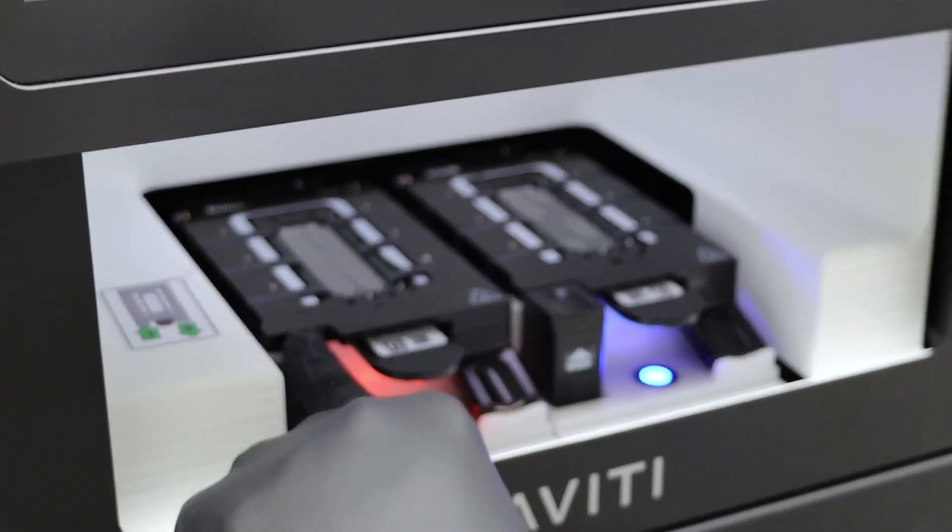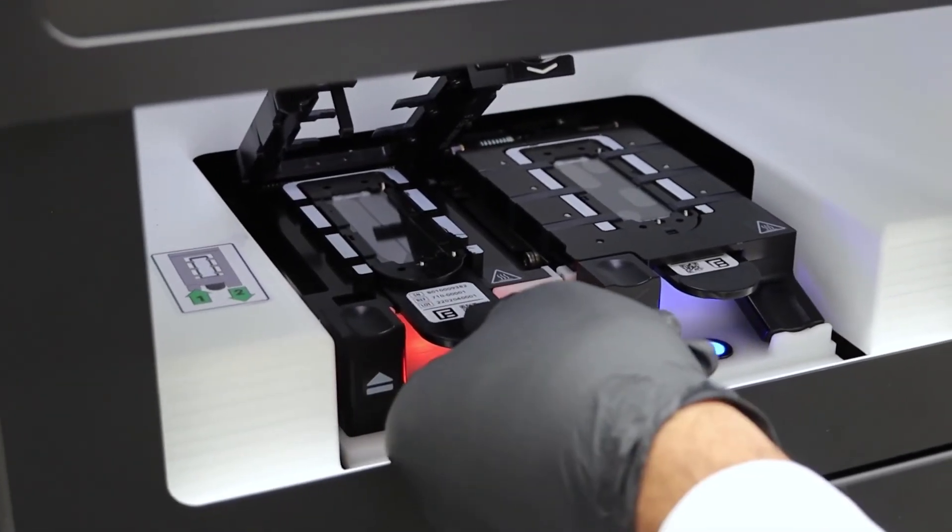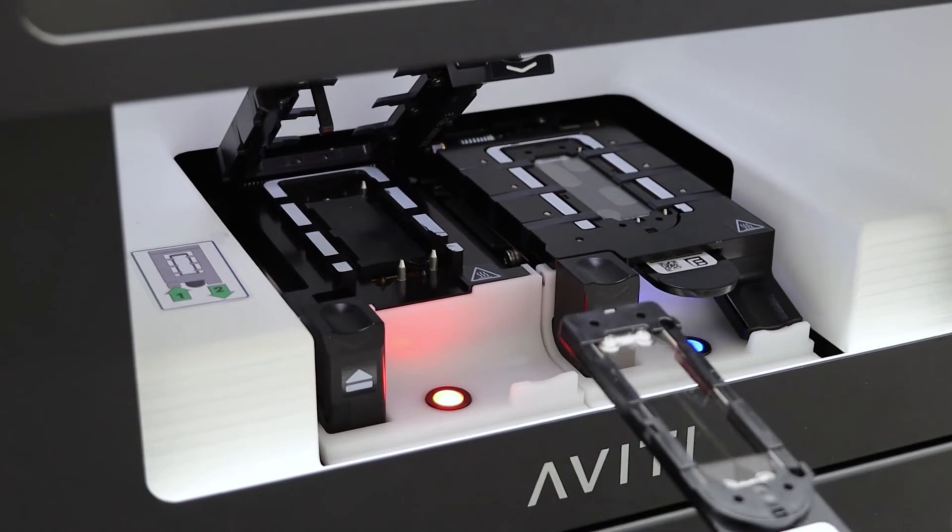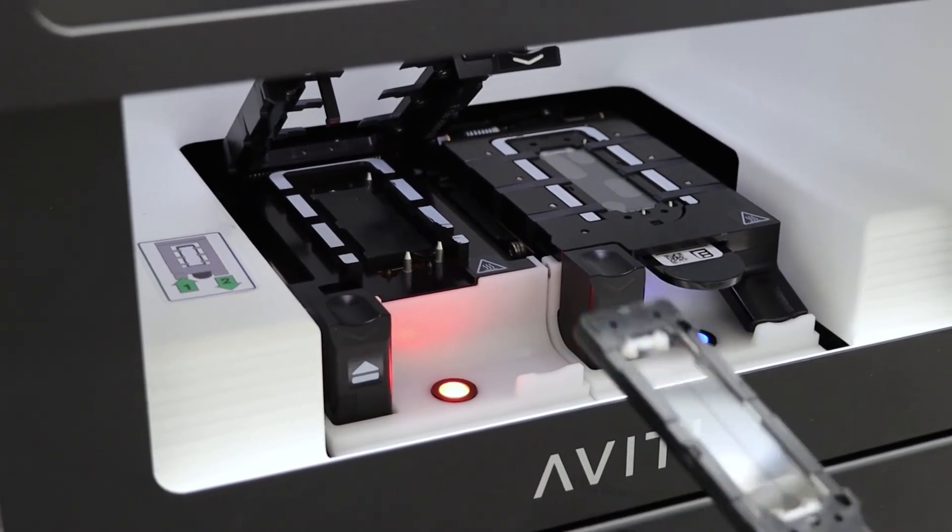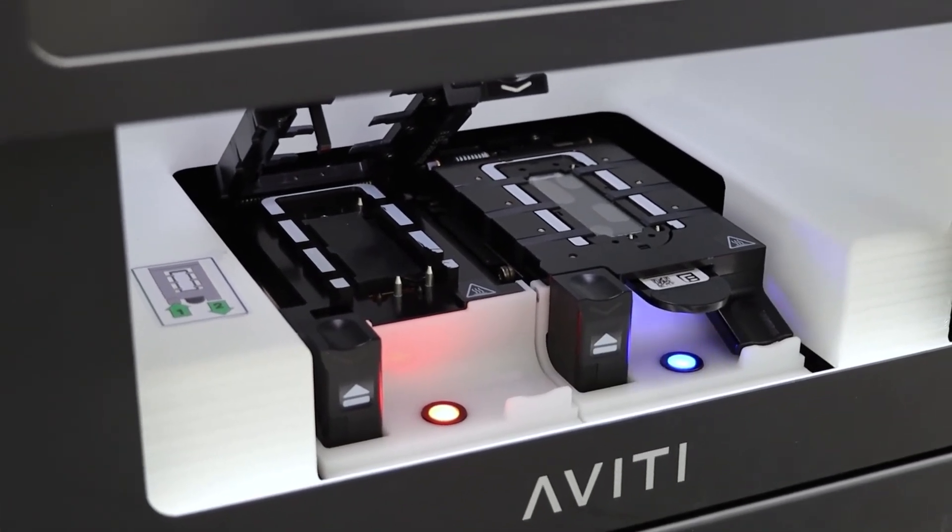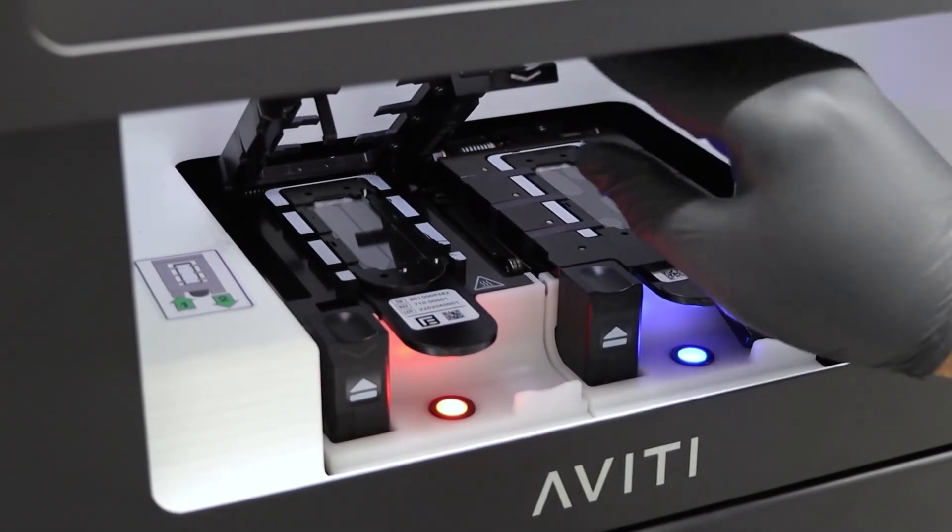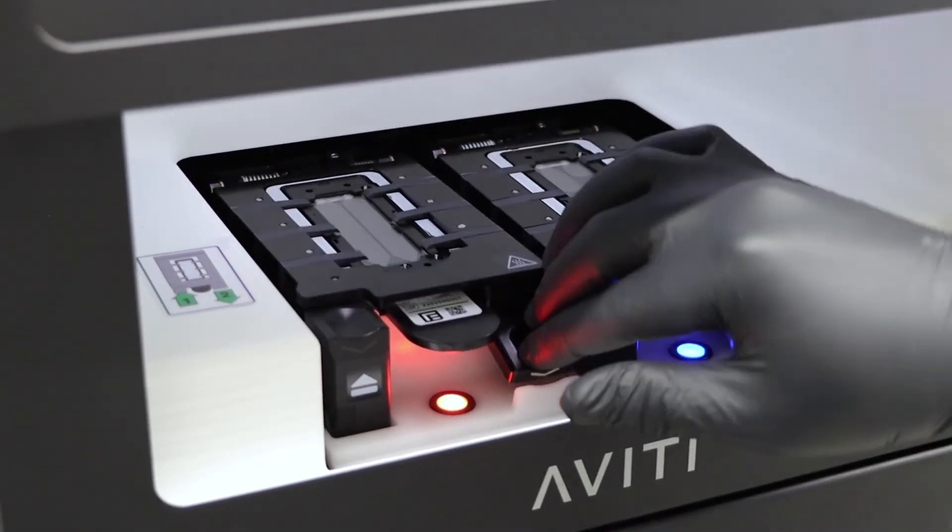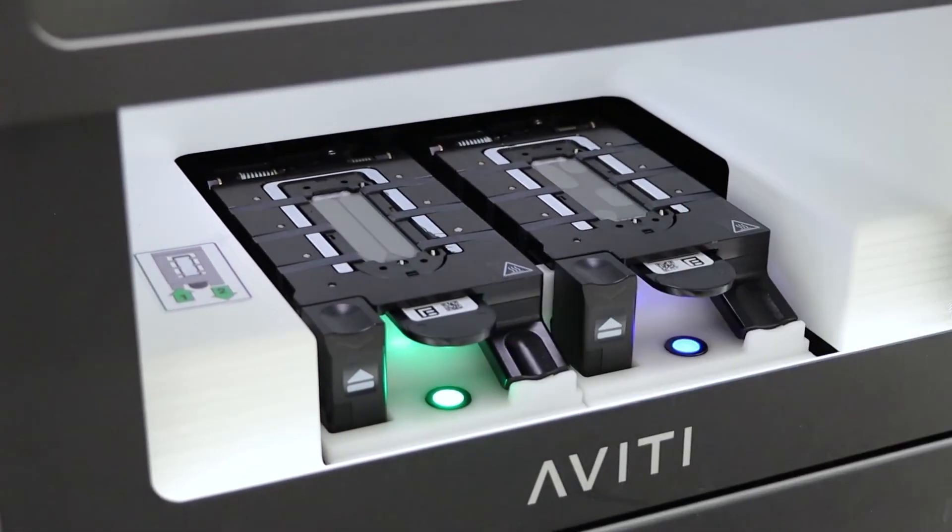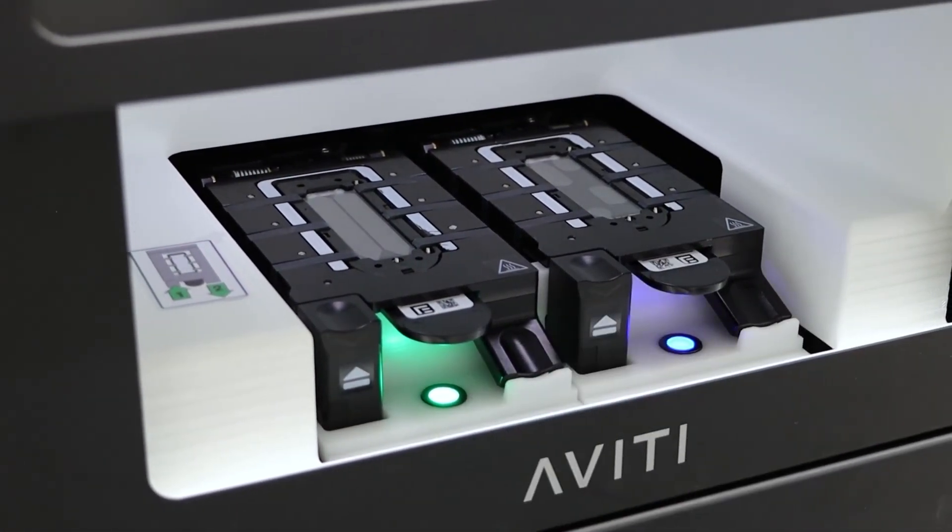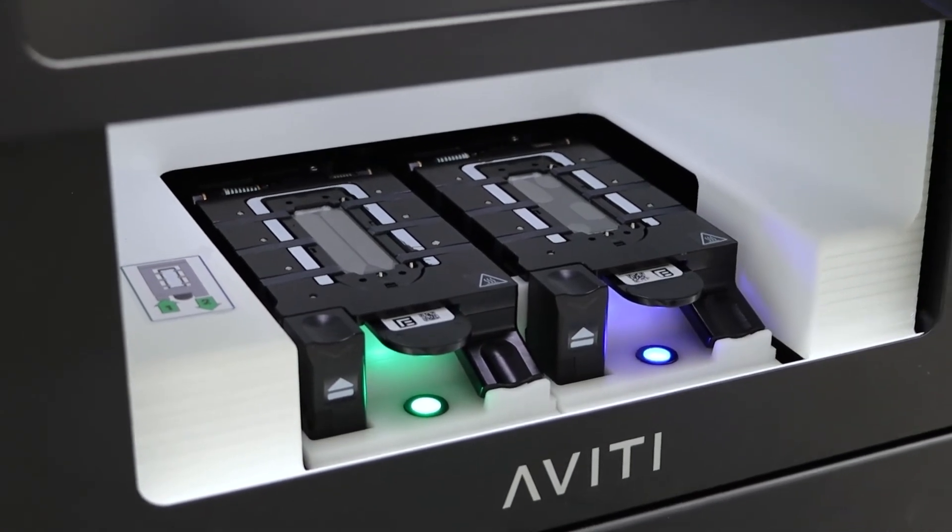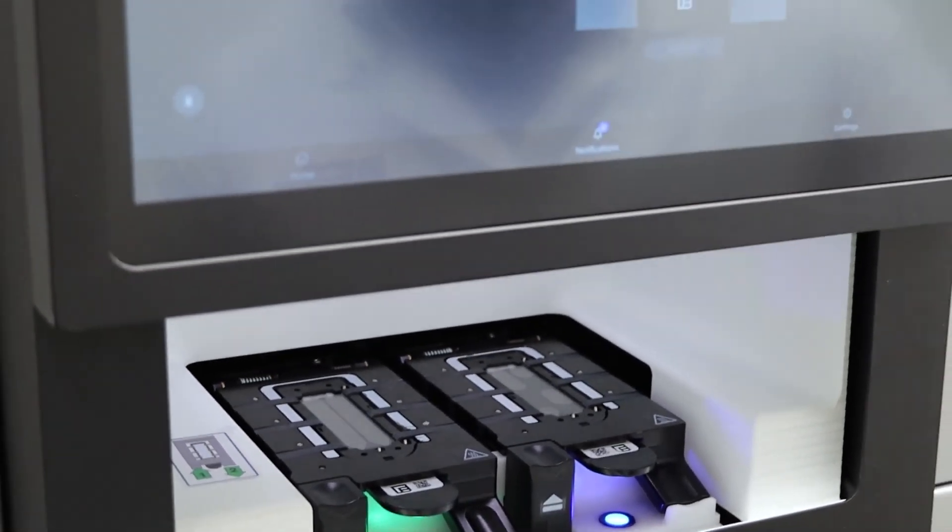So you'll unclamp the flow cell, remove the existing flow cell, get your new flow cell, put the new flow cell in, reclamp that flow cell, and confirm that you've received the green check mark.